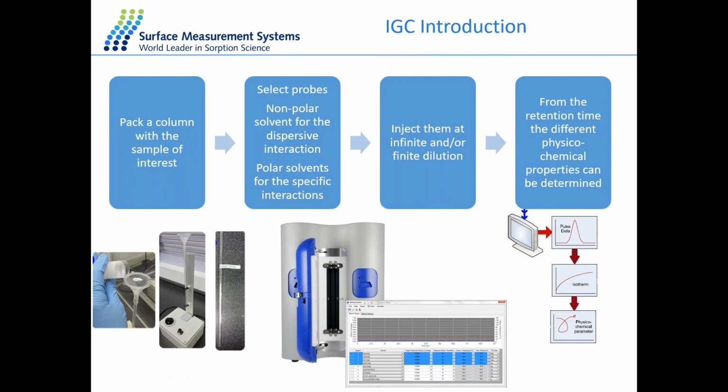So we have the non-polar probes for the dispersive surface energy, and we have the polar probes for the specific surface energy. We inject them at different concentrations to map the surface energy heterogeneity. And from the detected signal, we can calculate those kinds of properties on the surface.